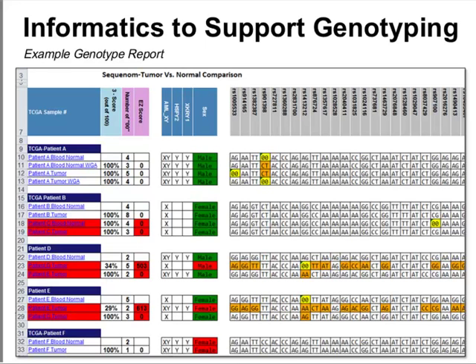So here's an example of the report that we use. I mentioned that the samples are grouped by plate, so we would pull this report based on the plate identifier that we put into the Dropbox. Within that report, the samples are grouped by patient: patient A, patient B, patient D. Within each patient, you get all of the samples that have been genotyped for that patient, regardless of what plate they were run on, as well as any patient that exists in the database that has greater than a certain degree of similarity, based on genotype, to the patient you're currently looking at.